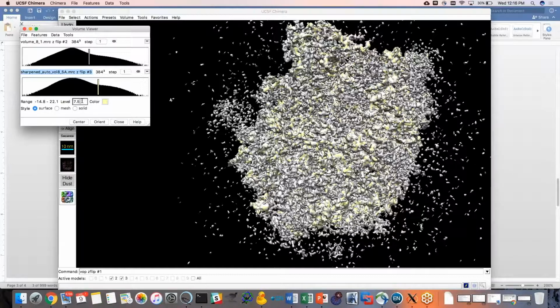And I usually try and identify this right away and flip it to the right hand. But when you're working at such low resolution, sometimes it's a little more ambiguous if you don't know what you're expecting. So, all right. So we've got our zflip. It's just when you go to fit atomic coordinates in there that you have a problem.